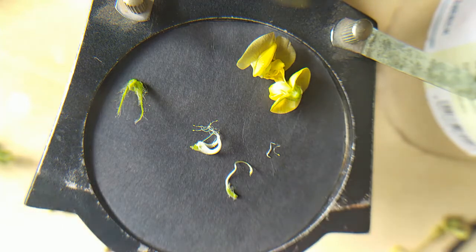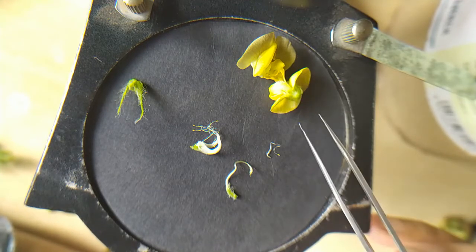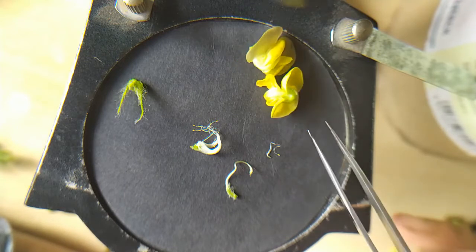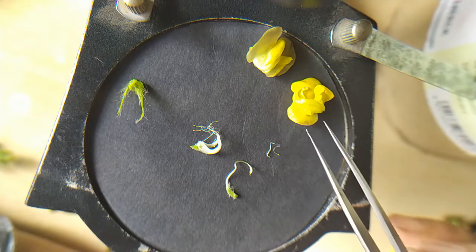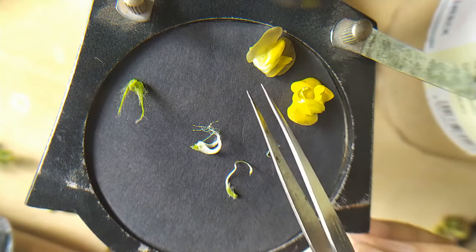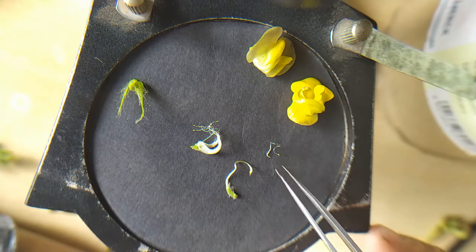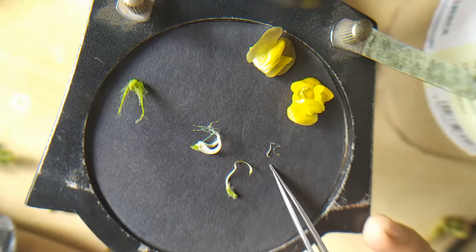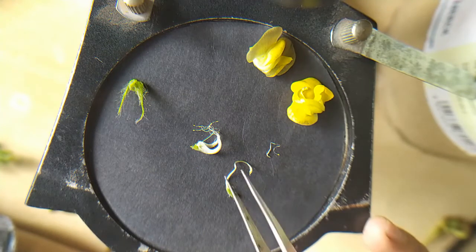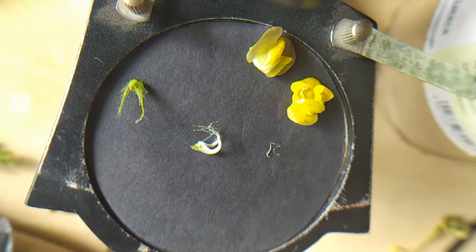Okay, now we will start a dissection of the flower. I will show you only one dissection. If possible, I will cover green gram, because the dissection of both flowers is the same. If I do a dissection of urad bean, the same dissection will be followed for the green gram. So let's start our dissection of urad bean. You should only understand the presence of the 9+1 condition in urad bean and green gram. One anther is separated from the bunch of 9 anthers, and inside that the gynoecium is present.